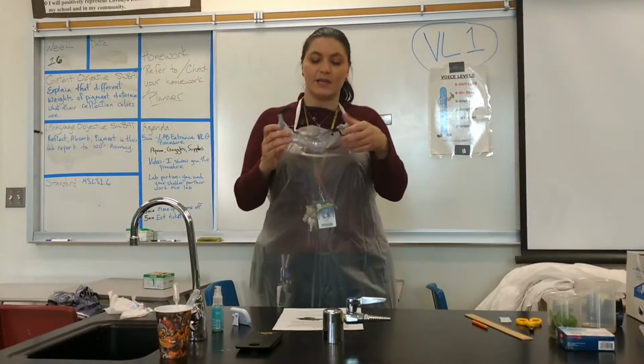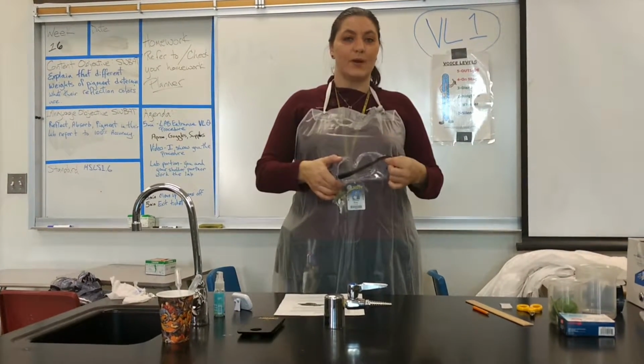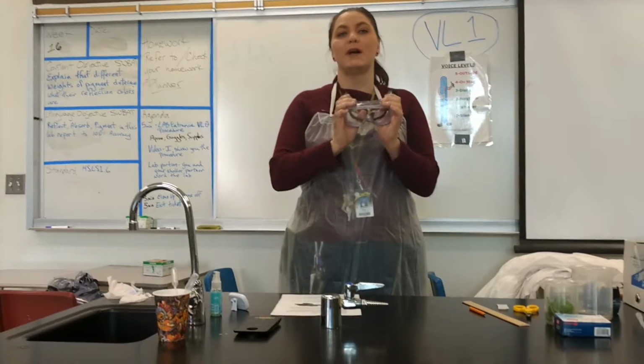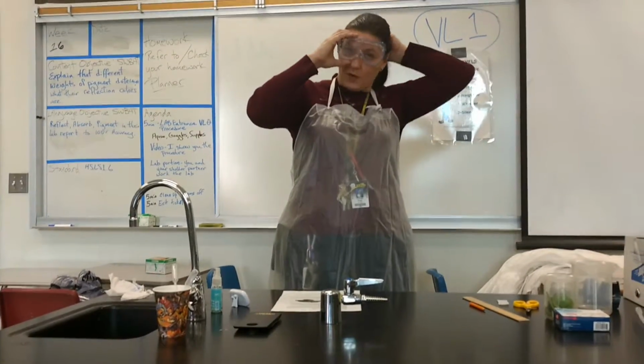All right, the next one is our goggles. Yes, of course, these goggles are sweaty, but the quicker we get through the lab, the quicker we can take these off. You cannot take these off until all your supplies are away from you, because again, we do have a solvent today. That's a liquid that we don't want on us.